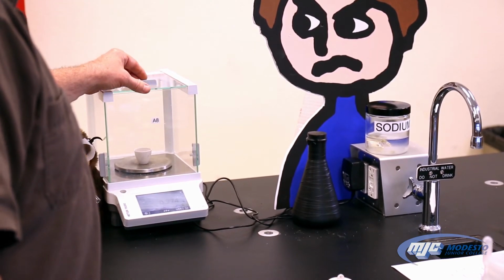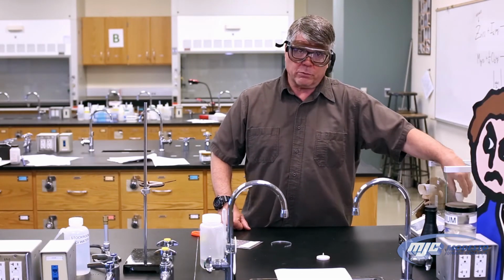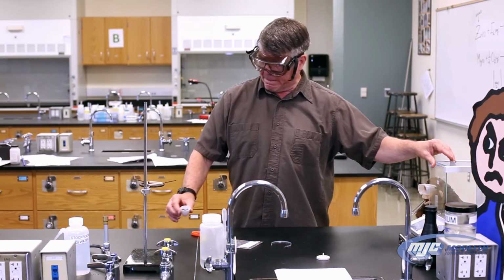That's a little under 0.3, good enough for us. This number, 3 places past the decimal, little g for grams, that's our B2. So now we're ready to start the reaction, which means we're just going to basically heat this up with a Bunsen burner.